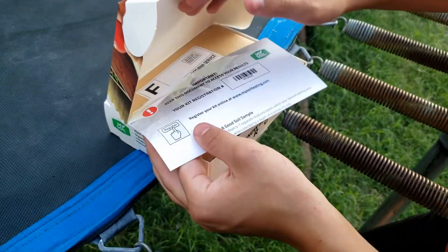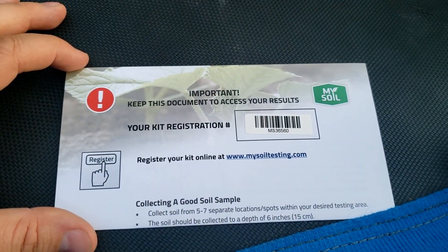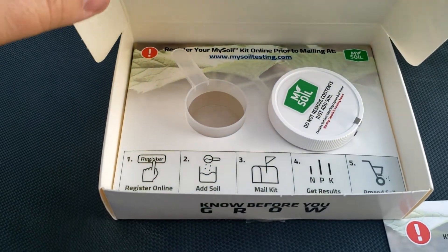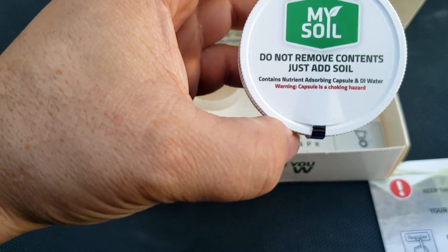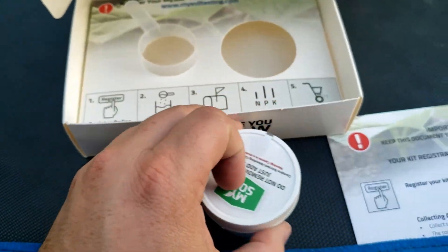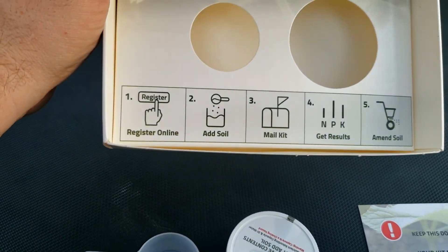All right, so are there instructions in here? Here's our kit registration — important to keep this document for our results — and we're going to share our information with you guys, so if you wanted to log in and see our results you'd be more than welcome to. It looks like it comes with a cup, some kind of liquid — 'do not remove contents, just add soil' — and then there's a measuring cup as well.